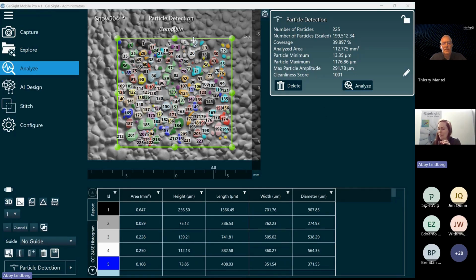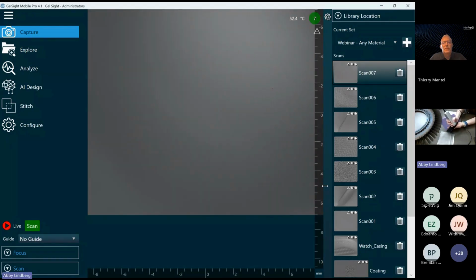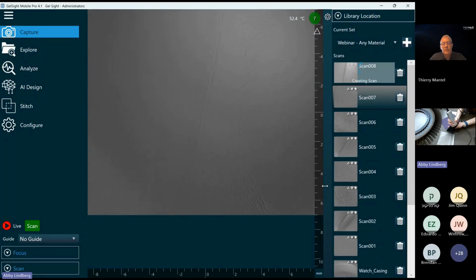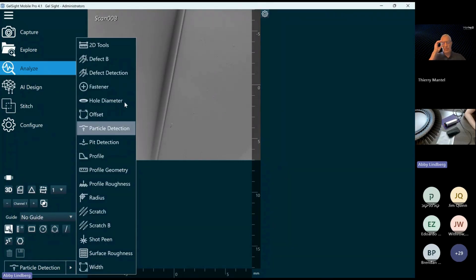So actually, let's jump over and I'll take the scan of that here. And I'm just going to press the gel onto the corner of this surface. So this is the interface on the side of the smartphone, going from glass to metal around the corner. And you'll see that there's no difference to the system, whether we're looking at glass or metal in that scenario. So we can come over here and let's just take a look at the profile around that corner. Something like this.